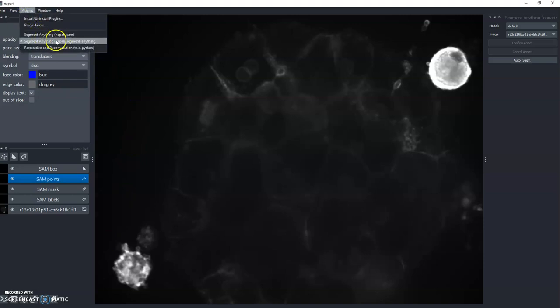Okay, so you can see here there's two segment anything tools, both called segment anything. The one I'm using is this Napari segment anything, not the acronym, and it's from the Royer Lab, and I'll give a link to it in the question. The cool thing about this little plugin is it's really useful for quick labeling using points.